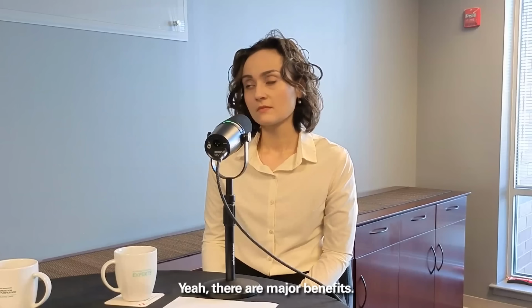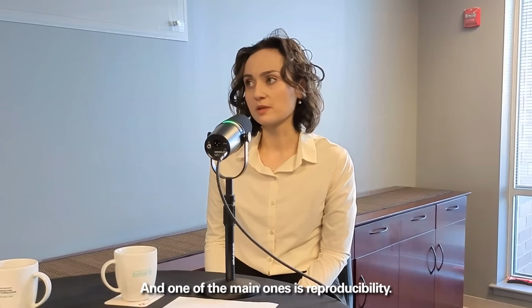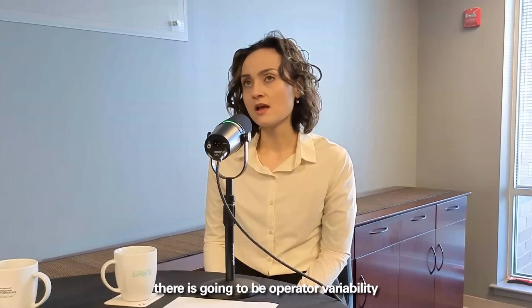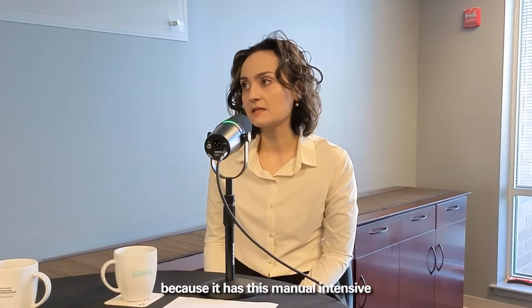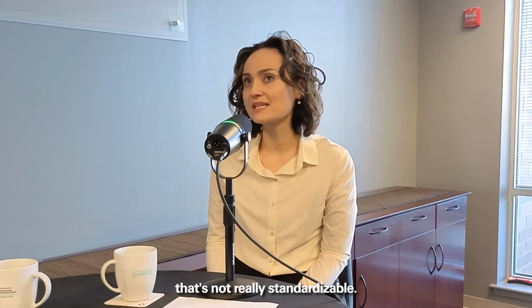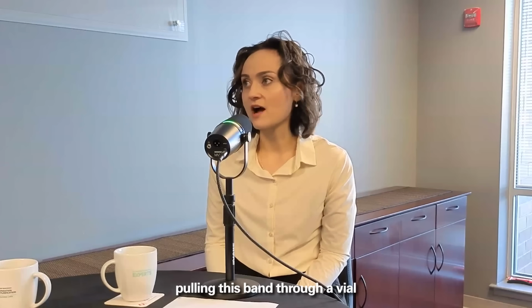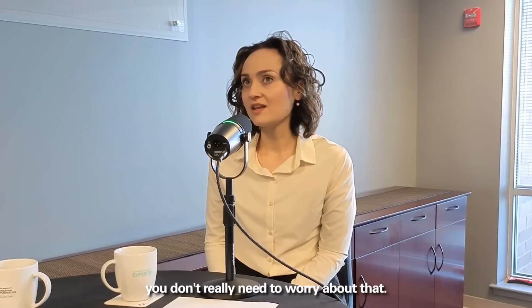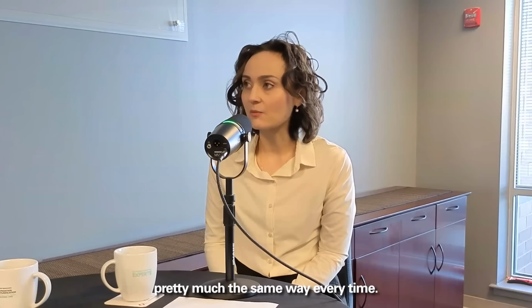Yeah, there are major benefits, and one of the main ones is reproducibility. So with, for example, preparative ultracentrifugation, there's going to be operator variability because it has this manual, labor-intensive band collection step that's not really standardizable. It would be one individual pulling this band through a vial. That's not a really robust kind of procedure. So with chromatography, you don't really need to worry about that. Your method will run pretty much the same way every time.